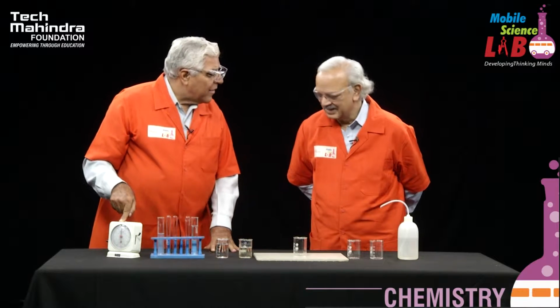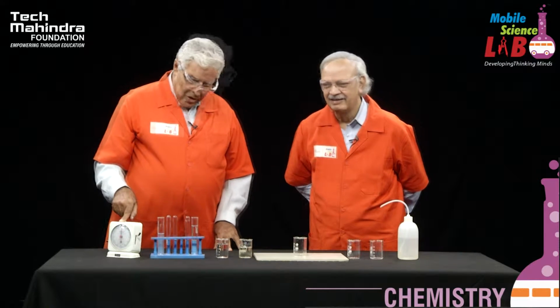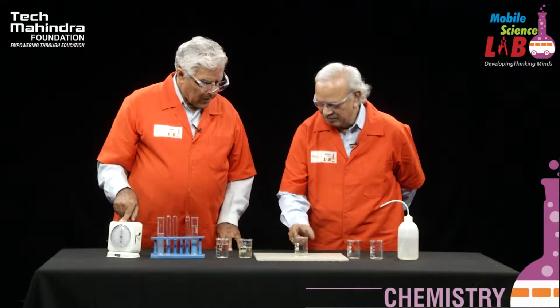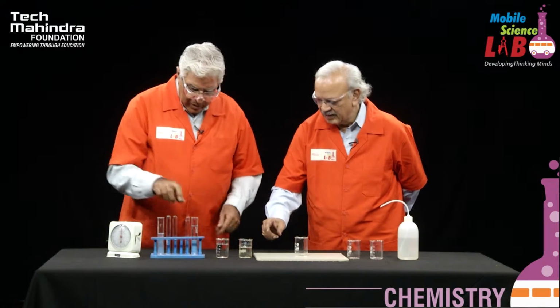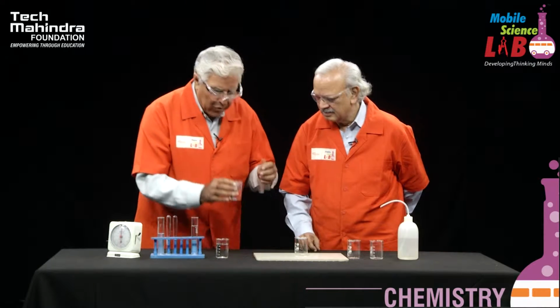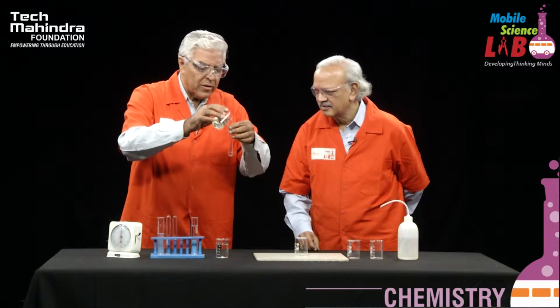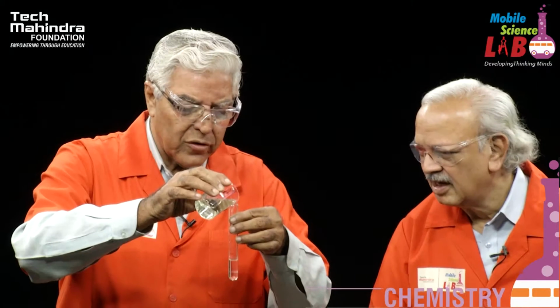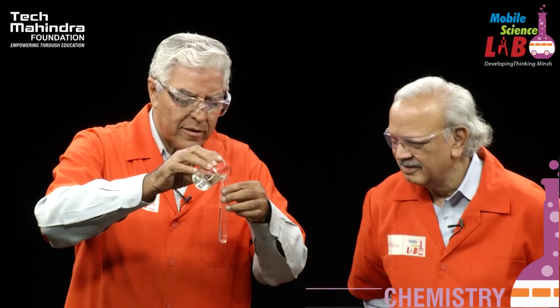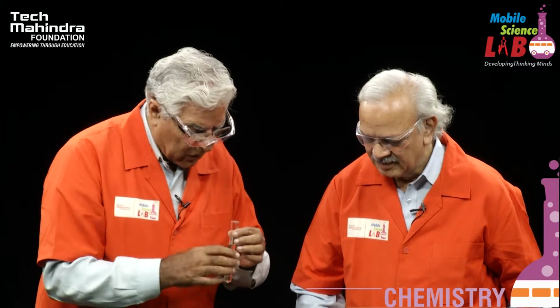So Sai, how would you like to start this reaction? We first do the experiment directly. All right. Here we have this beaker. Take about 20 ml roughly. You can use a test tube and take half of it. I am going to take a test tube and fill it up with persulfate solution. Half the volume should be all right. This is enough? That's fine. So, shall I pour it into it? Pour it into it.